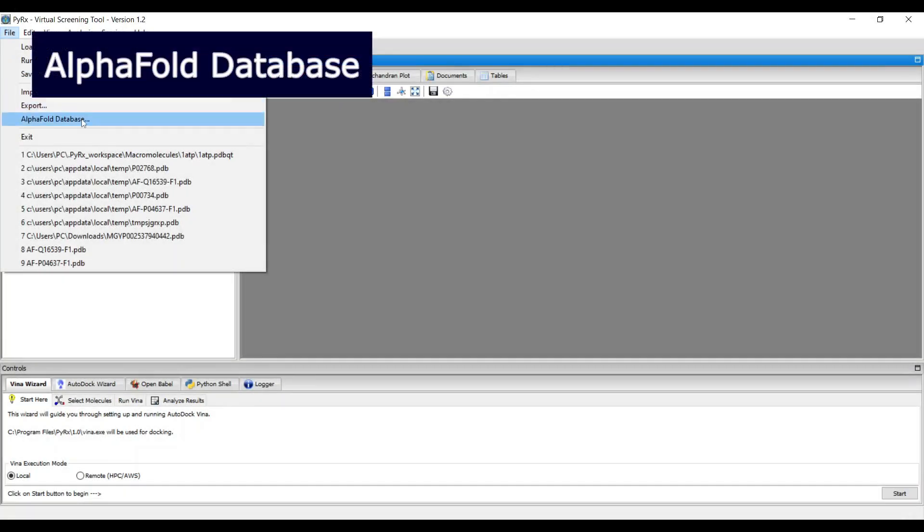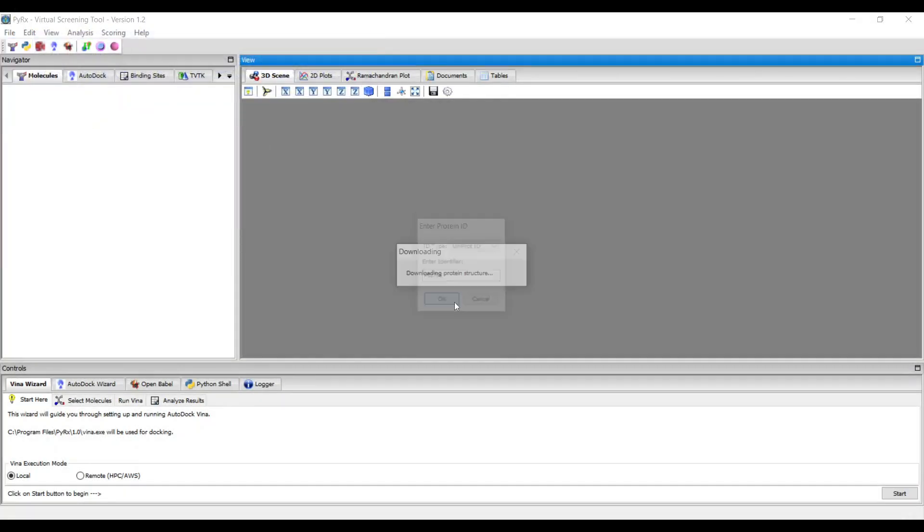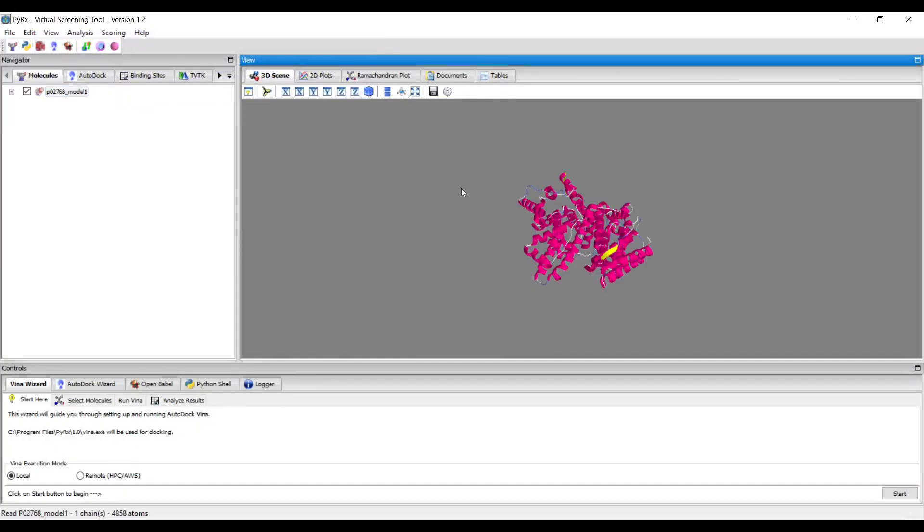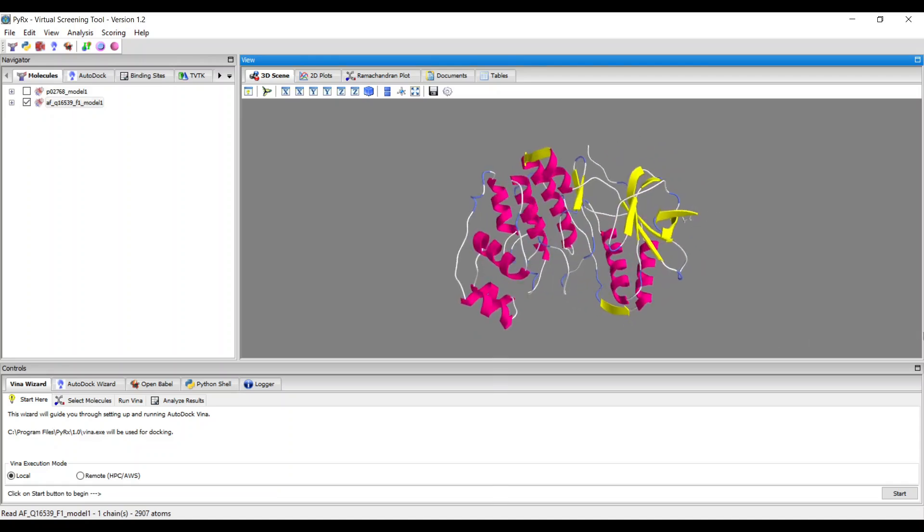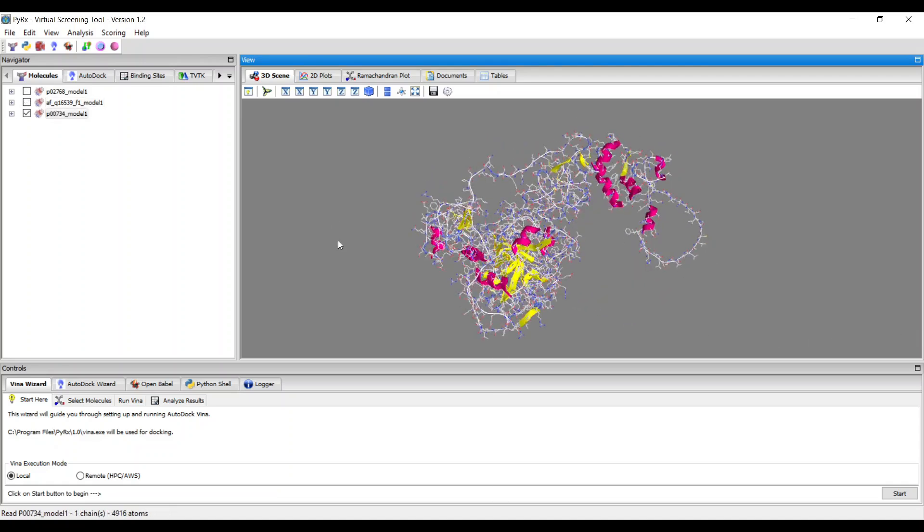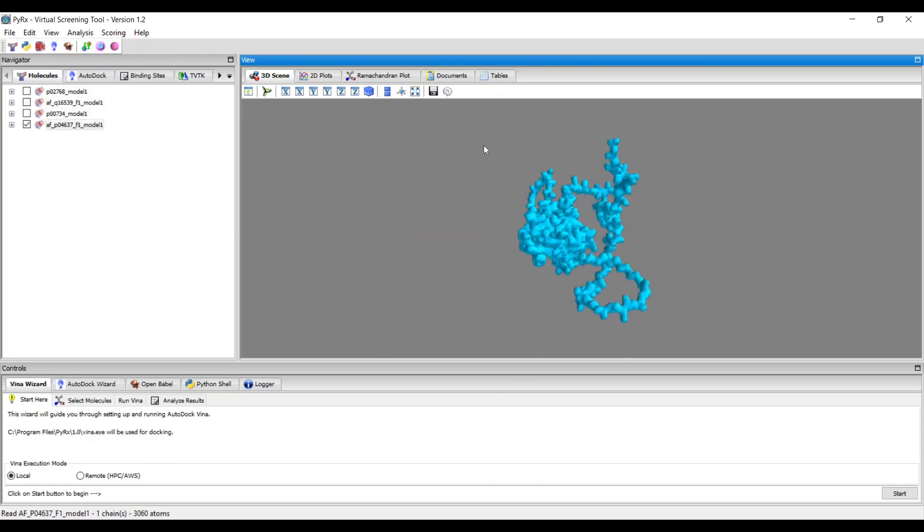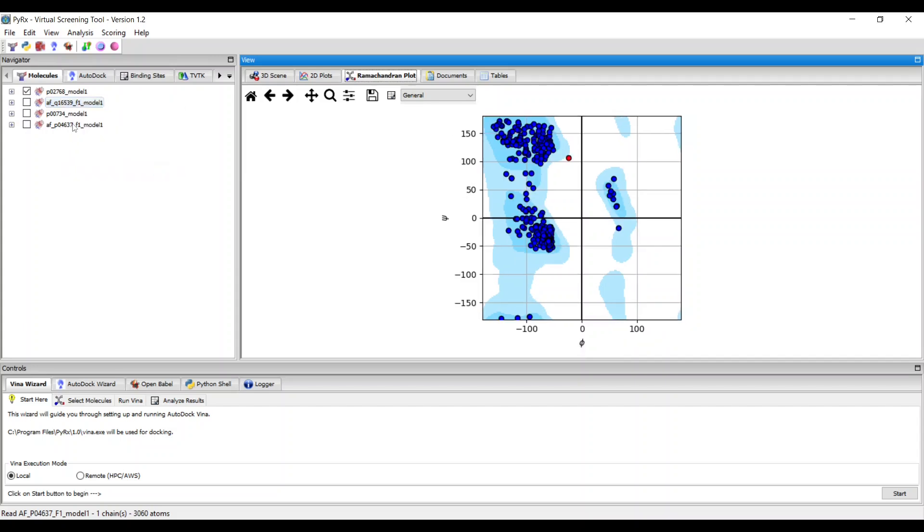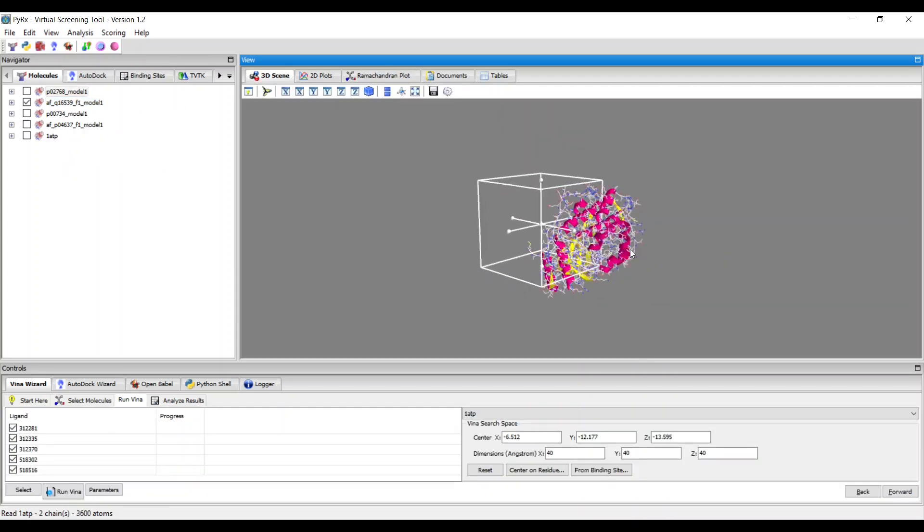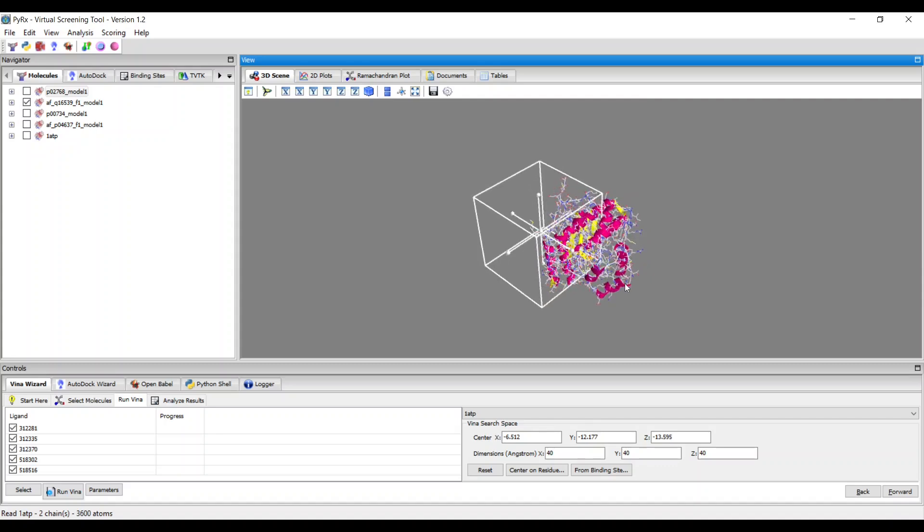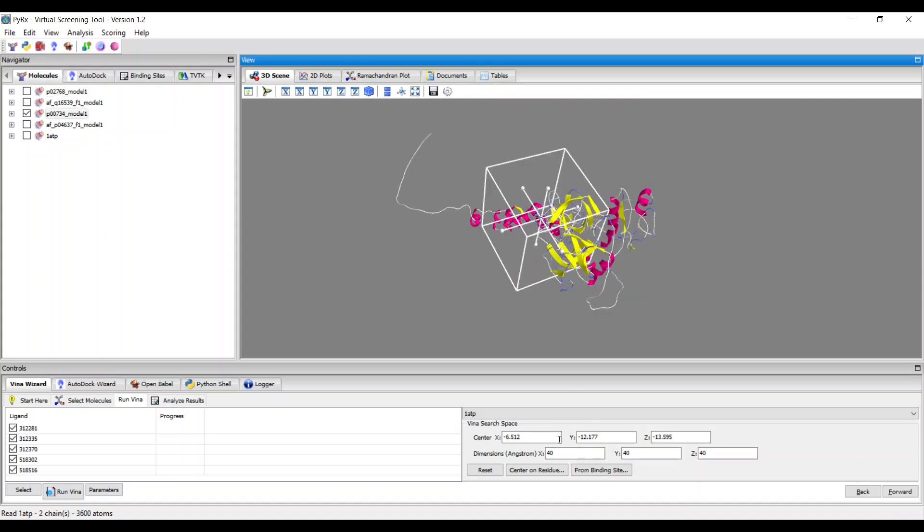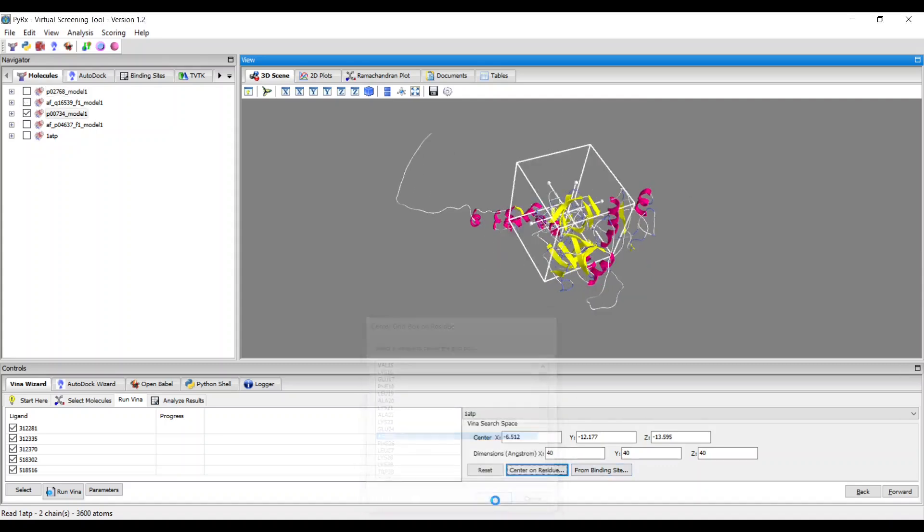You can now easily download structures directly from the AlphaFold database and import them in Pyrex. You can seamlessly use the AI-generated macromolecule structures for molecular docking within Pyrex, which expands the possibilities of molecular docking with AutoDoc.